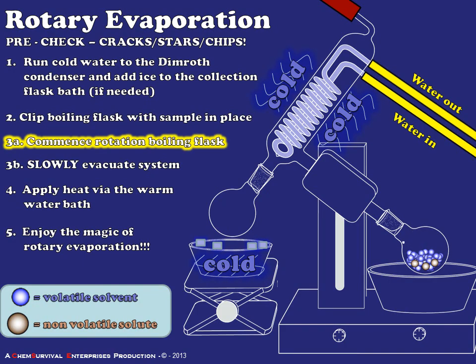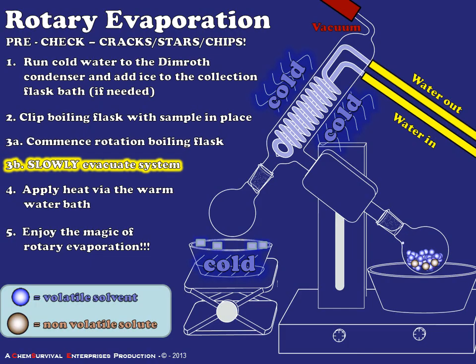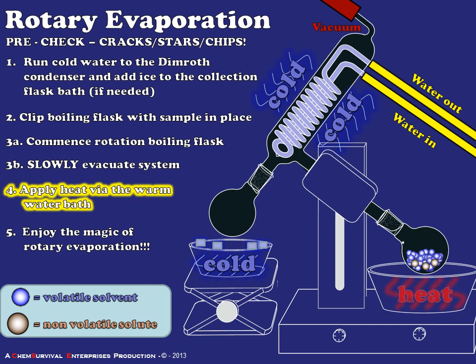Rotation serves two purposes. First, it spreads some of the solvent out along the interior walls of the flask, promoting evaporation. Second, it agitates the sample slightly, which reduces the risk of bumping or flash boiling, which can cause solvent contamination or otherwise adversely affect your rotary evaporation. In the next step, we'll slowly evacuate the system by opening the vacuum line. As we do that, the sample is now being agitated and is under reduced pressure, which means that the boiling points of all the volatile materials have been reduced.